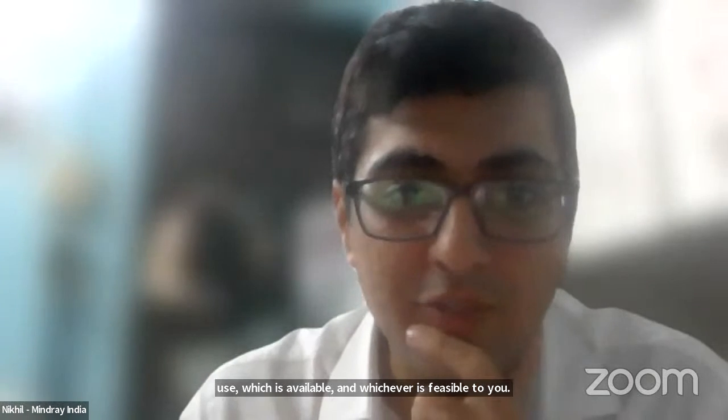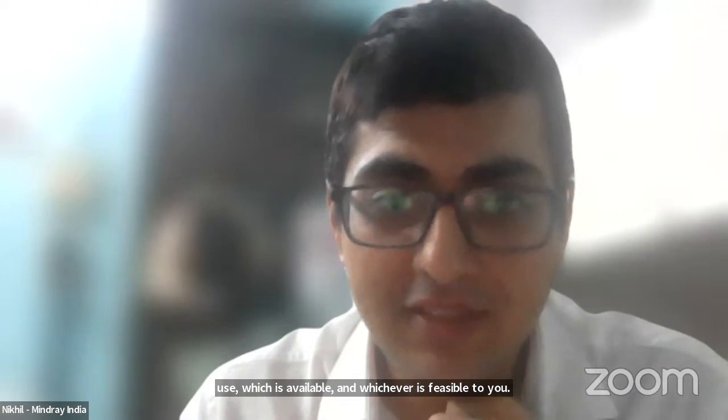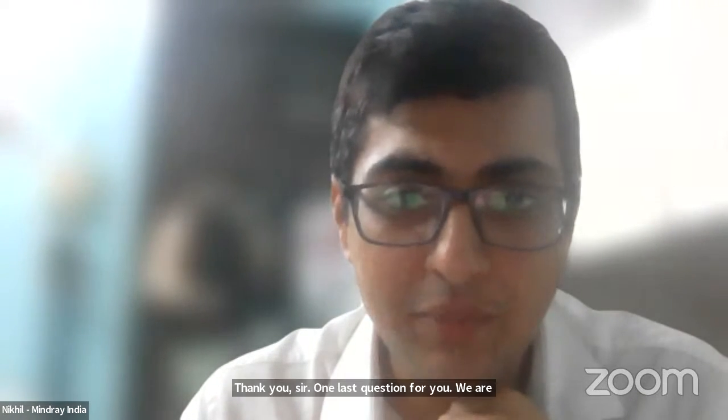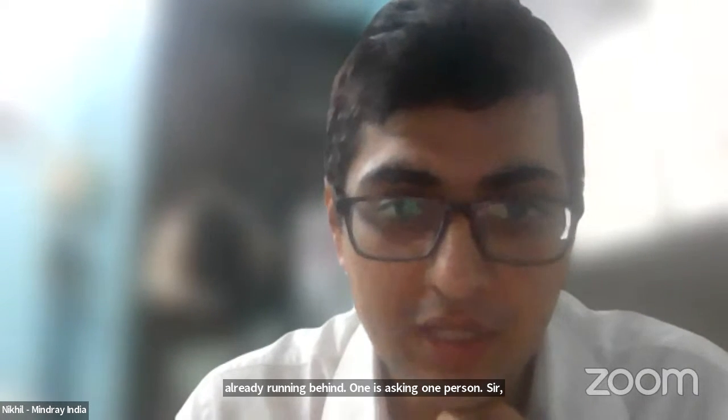Sir, thank you. Sir, one last question for you. We are already running behind. One person is asking, sir, how do I get the calibration and traceability of my pipettes, centrifuge, incubators, and things like that?